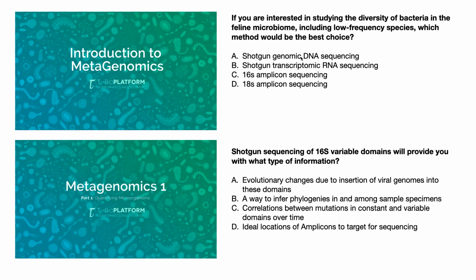But what about these two? So why not these? So when we talk about genomic DNA sequencing or kind of whole genome metagenomic sequencing, really one of the challenges is having those reference genomes for the different bacteria. So many of the references are not going to help us because of the variation. So the sequencing or the mapping quality that typically we're looking for is not going to allow us to map accurately all of the reads to the references that we have, because we do not have all of the references.